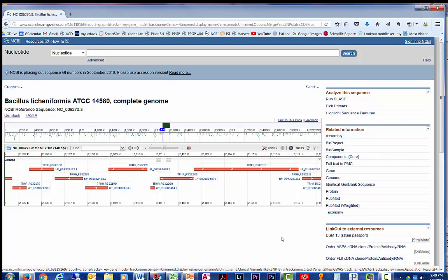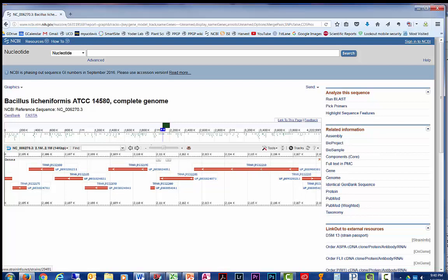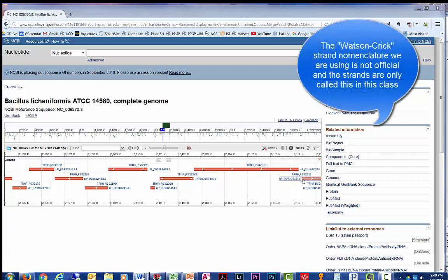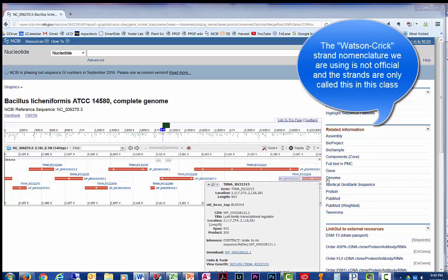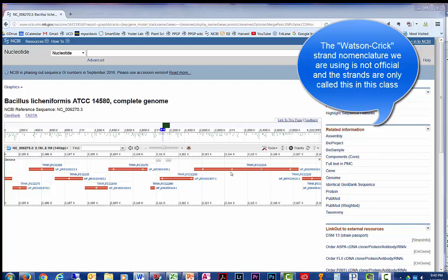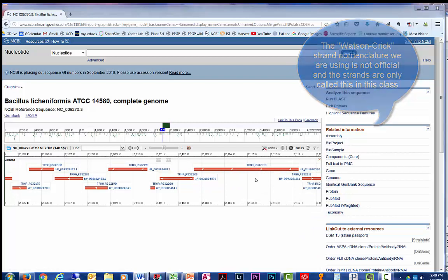Notice though that the different transcripts have arrows pointing in different directions. Sometimes they point to the right, sometimes they point to the left. This shows what strands are being transcribed. If the arrow points to the right, the Watson strand is being transcribed. And when the arrow points to the left, the Crick strand is being transcribed.